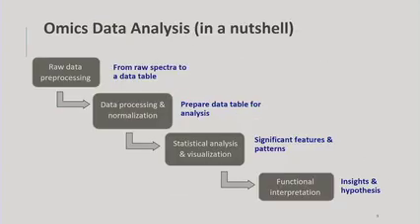And how do we solve the data analysis problem? I mentioned raw data processing. This really tries to generate a table, and there are two major approaches. There's MS data processing, which you learned yesterday, with MZmine, and there's OpenMS. MetaboAnalyst also has raw data processing. The other one is next generation sequencing. So more or less, you can think about two major things: sequence and spectra, right? They are getting better and standardized.